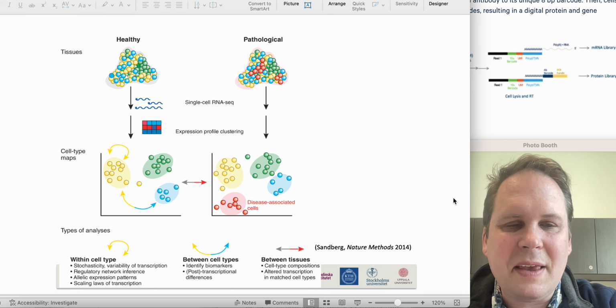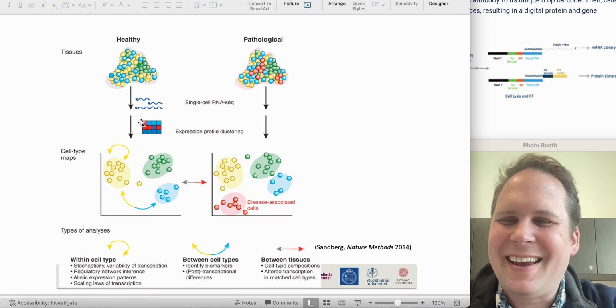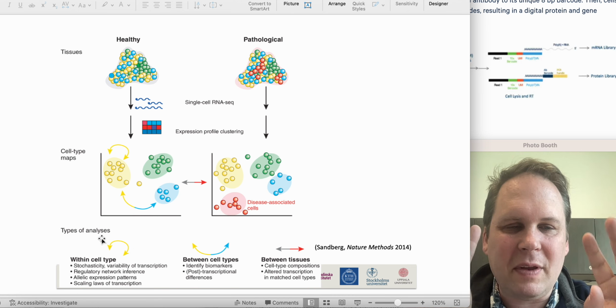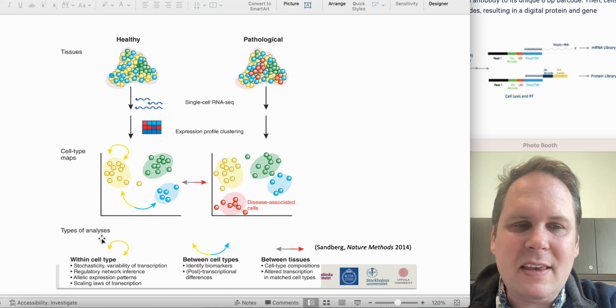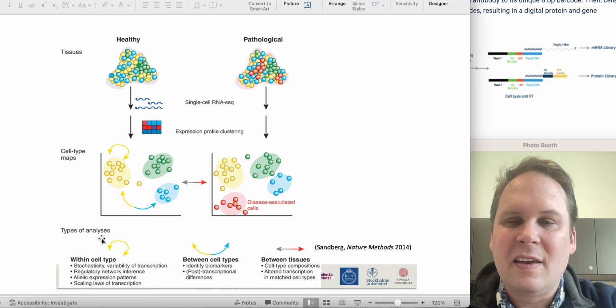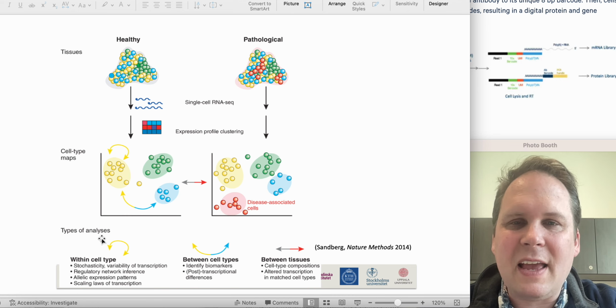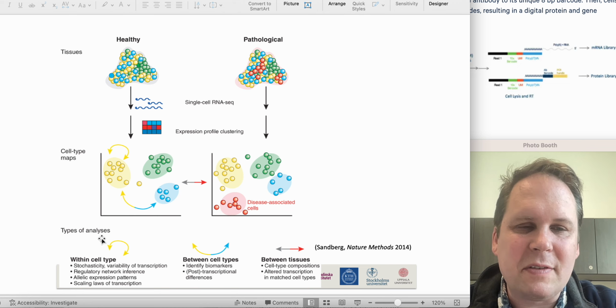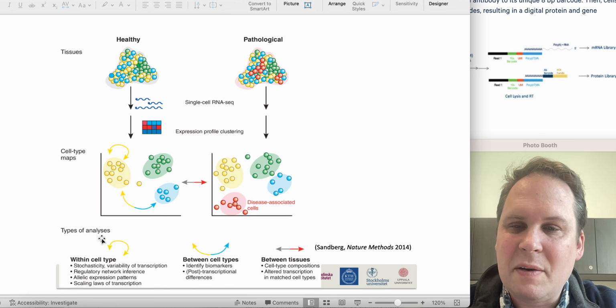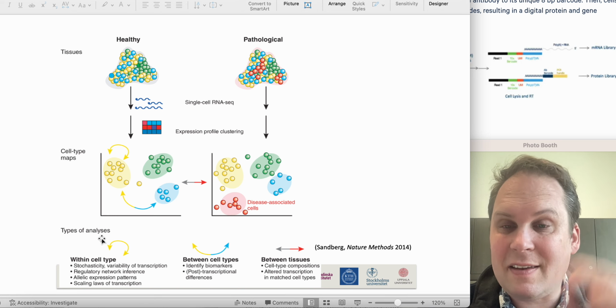So here's that same paragraph, but in pictures. You can take different populations of cells. You can look within what we think of as a type of cell, and see what variability there actually is inside of this group. You might think there are just hepatocytes, but there are probably several different versions of any cell type that are making more or less of certain proteins, and each of these probably plays some role in physiology, which may not have been known without this technique.